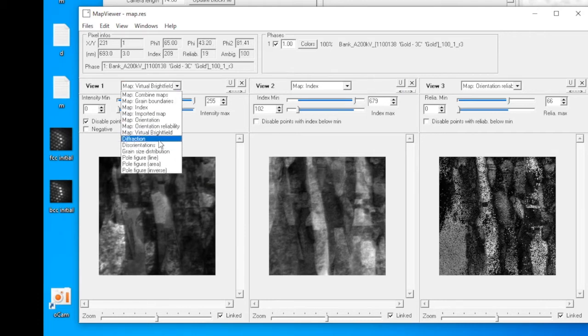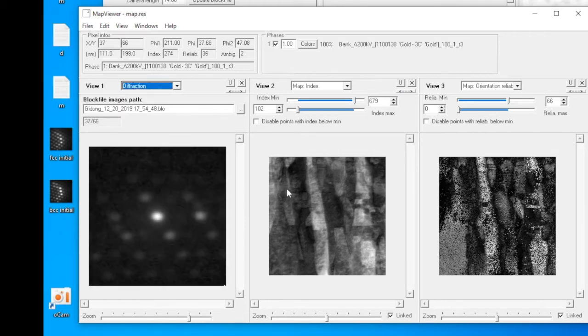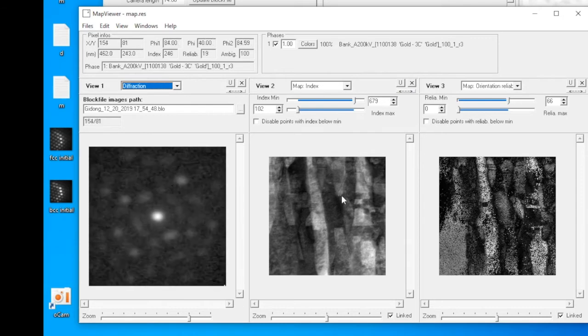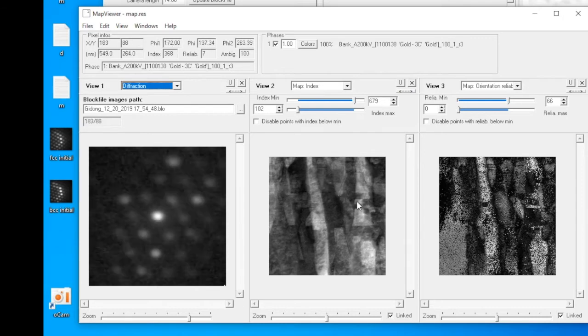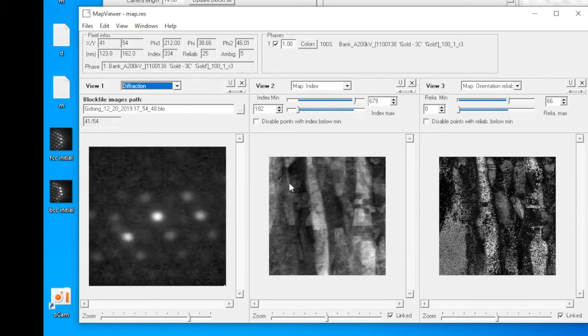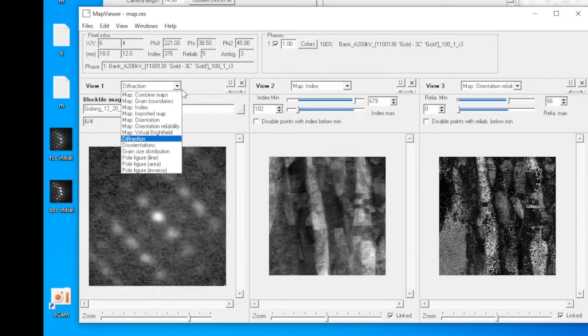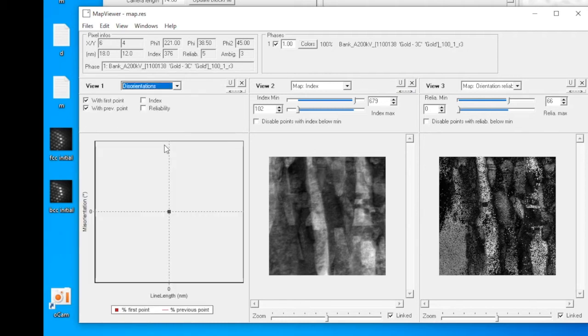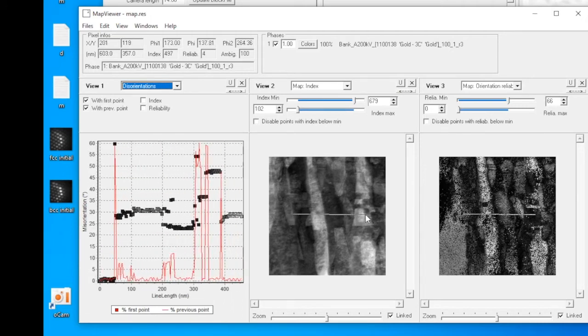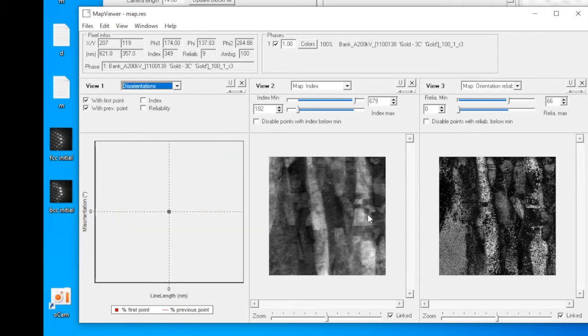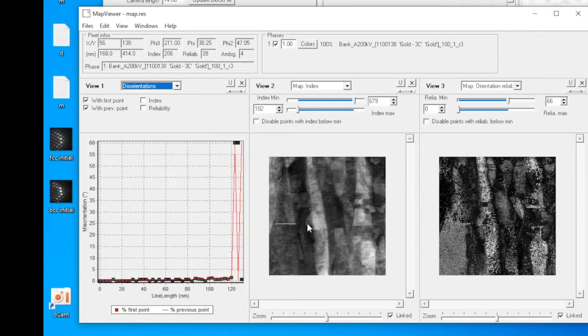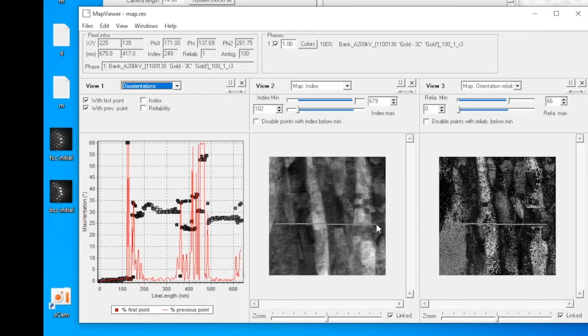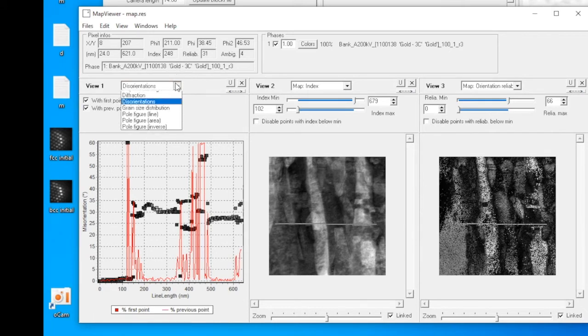Next is diffraction. So when you move your cursor on the map around, you can see the corresponding diffraction. After diffraction, that is the disorientations. I like to call them misorientations. Selecting disorientations, then draw a line in the micrograph. You can plot the point-to-point and the point-to-origin misorientations.